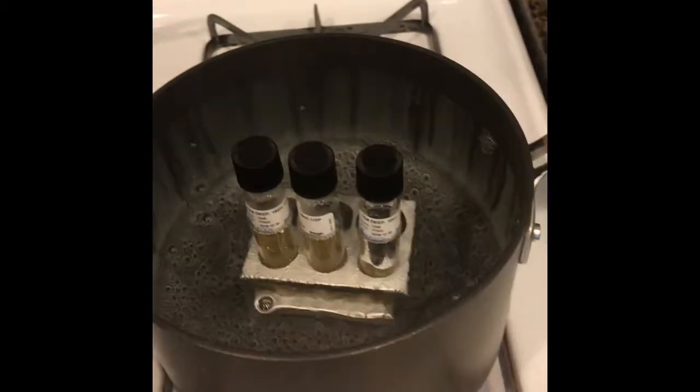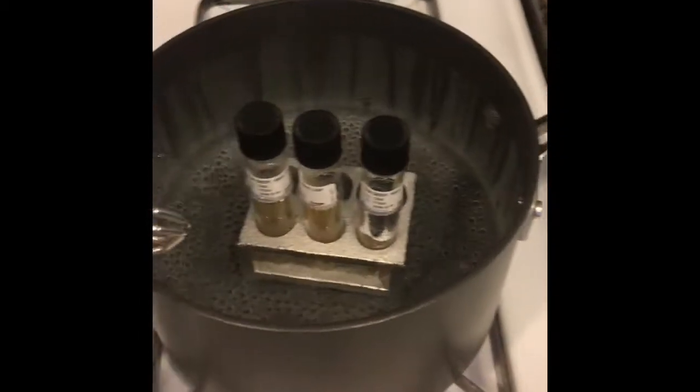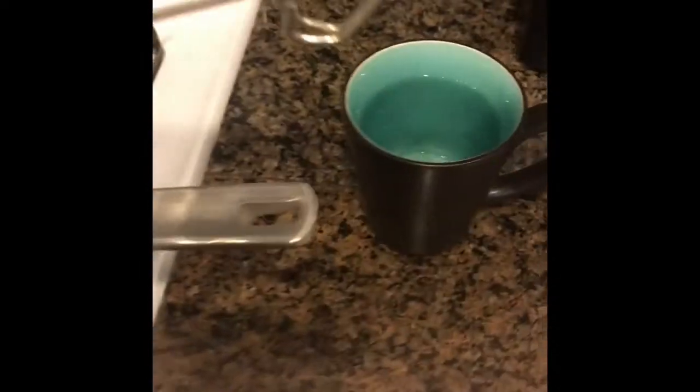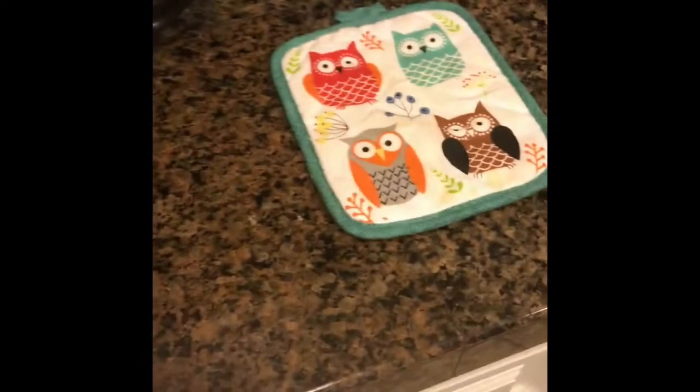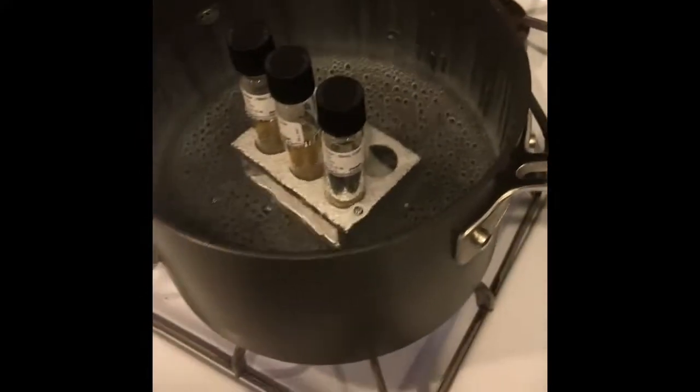I have all my little petri dishes labeled. So here I have the agar boiling so that it melts. And then I have here the coffee mug where I'm gonna put them in hot water still so that I can be able to pour. And I have my little oven mitt thing so I can get them out.